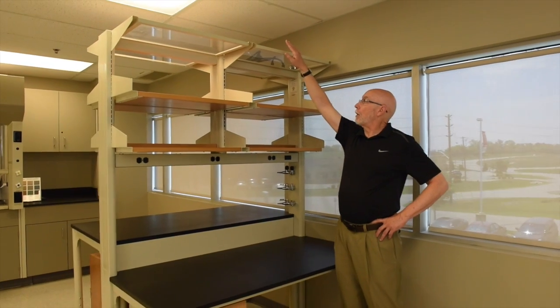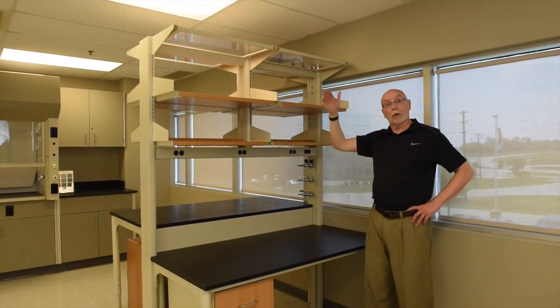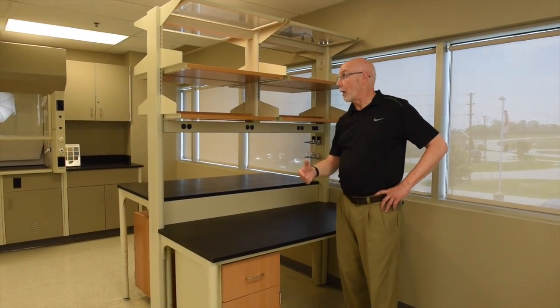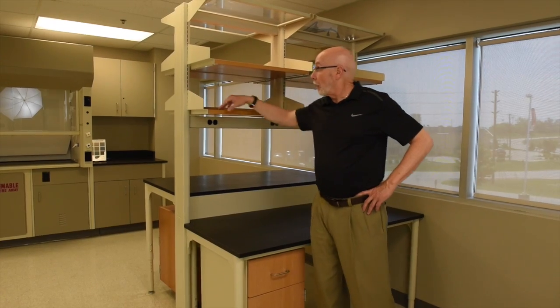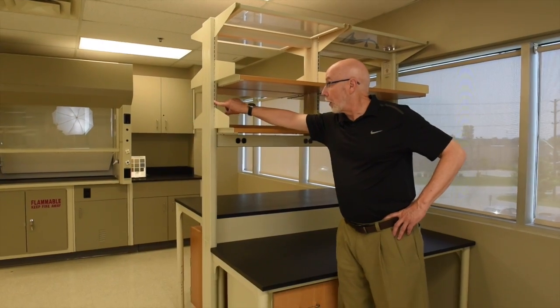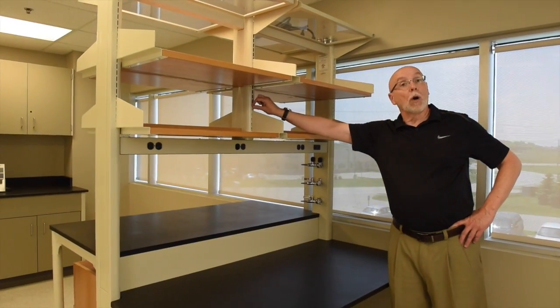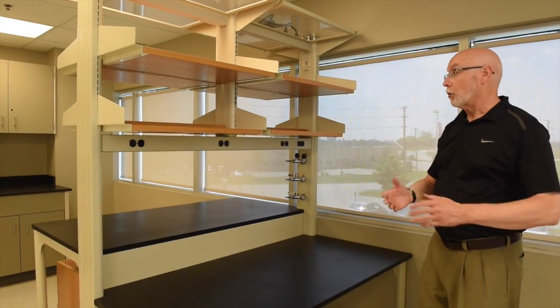For shelving, you'll see that we offer glass shelves, wood shelves, and metal shelves — 14 inches, 15 inches, 12 inches. We're certainly very comfortable doing custom sizes. The shelves are adjustable in one-inch increments. To show an attention to detail for Mott, you'll notice that the slots on the sides here are made for one shelf standard, while here in the center they're a little bit wider, made for two shelf standards — again, an attention to detail.